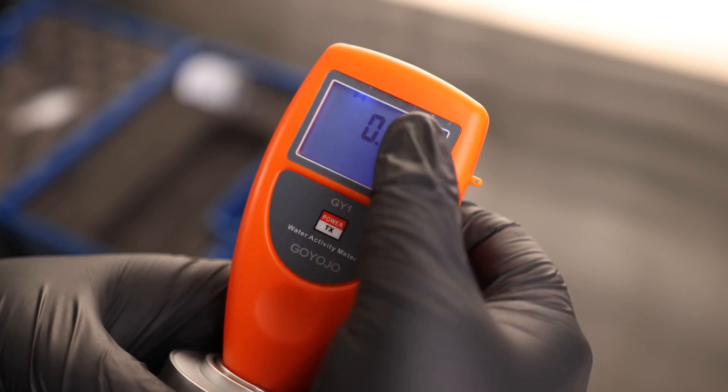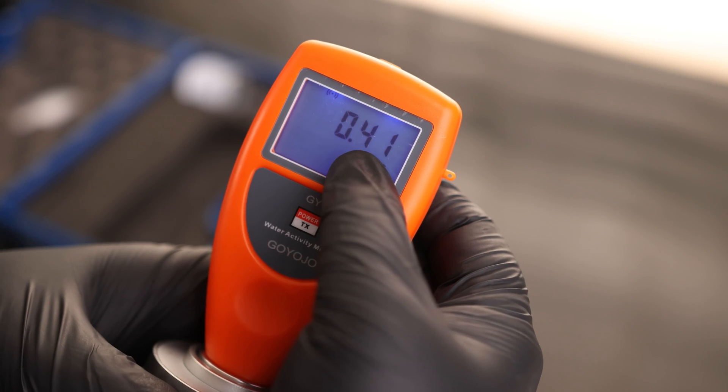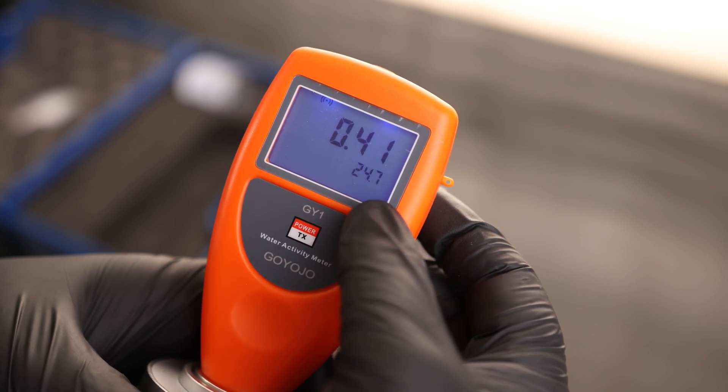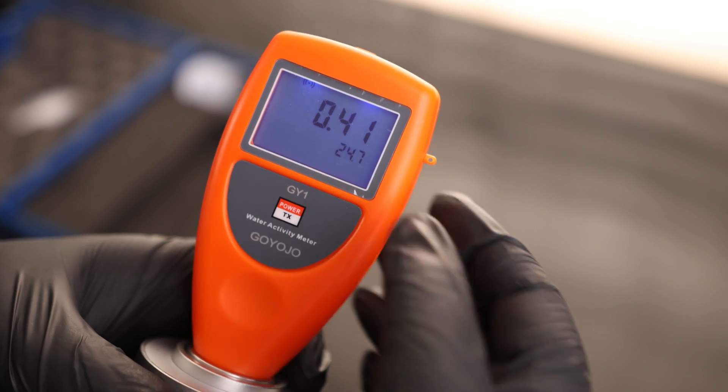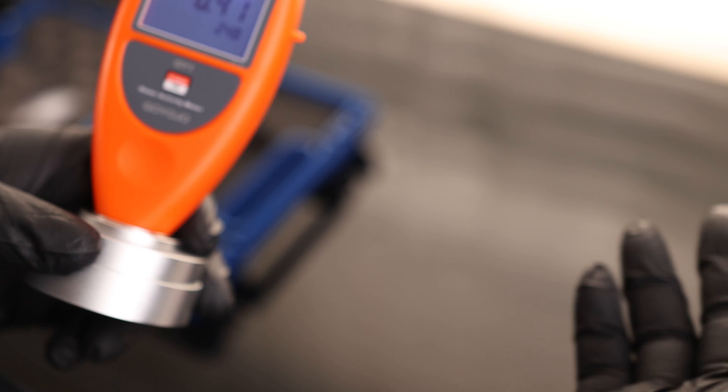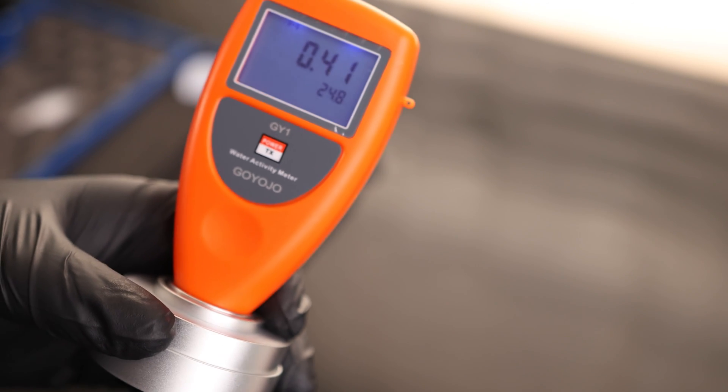When we turn it on — that's nice — it actually has a backlit display. We can see the current reading of 0.41, so it's just going to be constantly reading. This is what is in the chamber while it is empty. It also shows the current temperature, and the temperature can be important because if it is too hot, it can actually make condensation rise into the sensor. So you don't want to test a product that was sitting out in the sun.